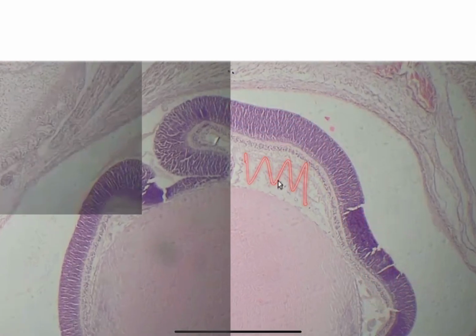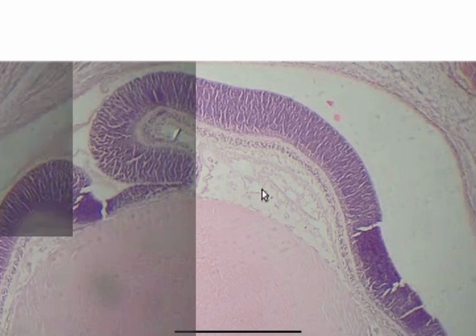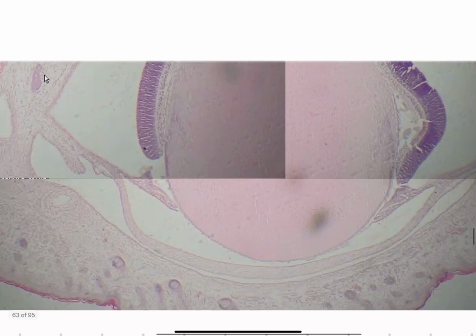We can also ask you about, as if I'm part of the main gang, the professors can also ask you about the vitreous body, as well as the remnants of the arteria hyaloidea there. They can ask you about the long lens fibers, as well as the anterior cuboidal epithelium here. I believe this is also the cornea of the eye. So we have the anterior eye chamber. Because this is an animal eye, it looks kind of odd and different. This would be the ciliary body, I believe, or even part of the membrana pupillaris. It looks very strange here, though, I must admit.